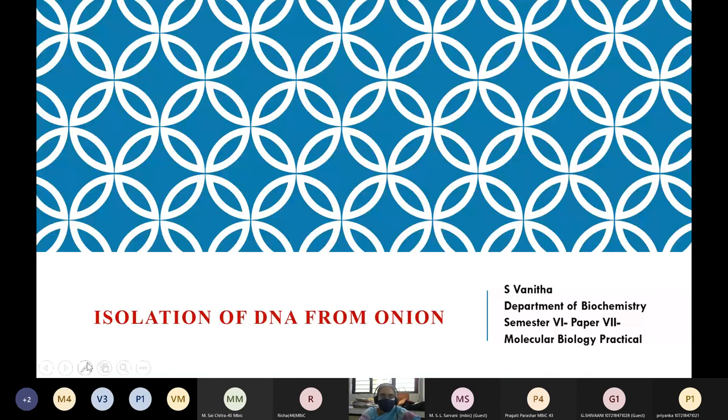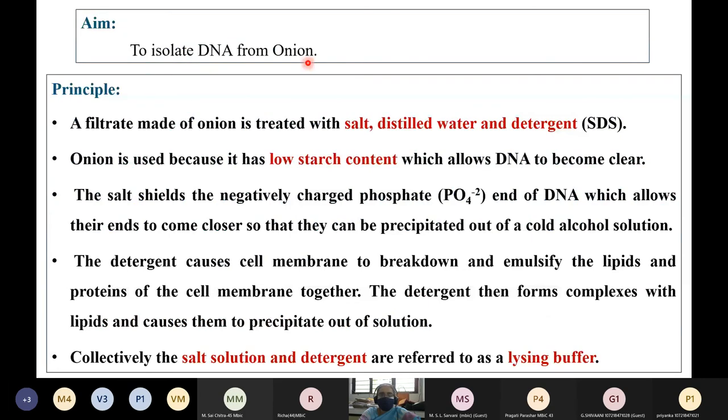Students, the experiment is isolation of DNA from onion. Onion is one of the sources from which you can extract DNA very easily. Other than onion, you can also try with coconut endosperm as well as from the liver, though they will require more steps compared to onion. The experiment is to isolate DNA from onion.